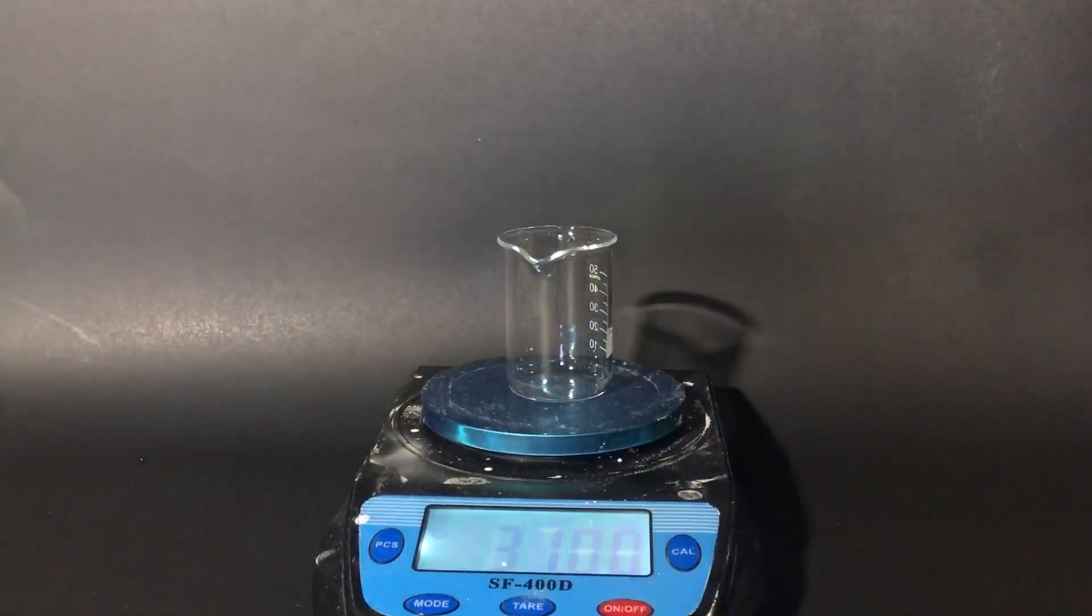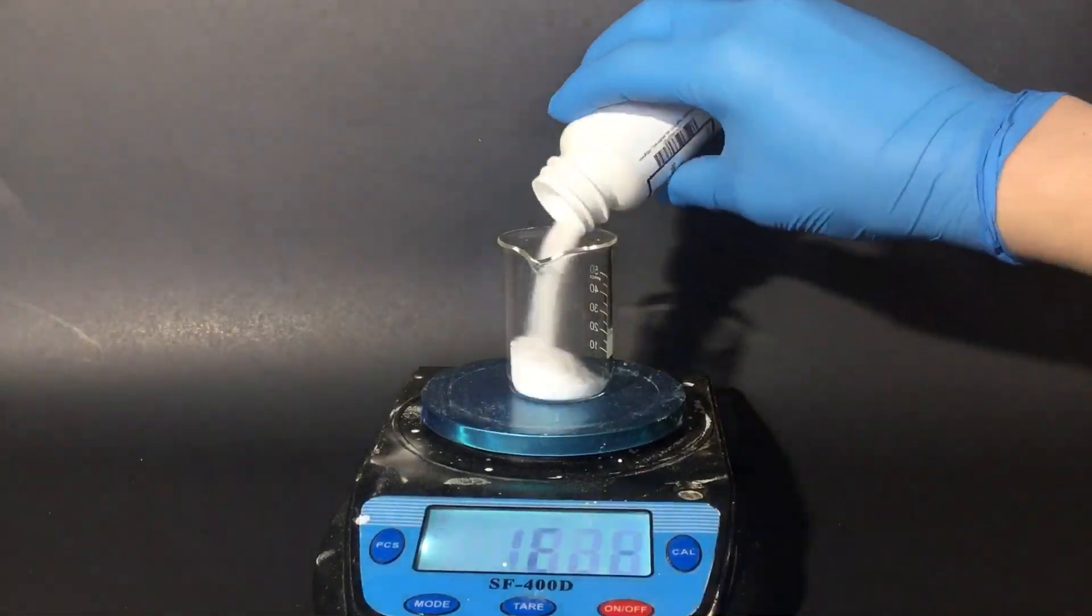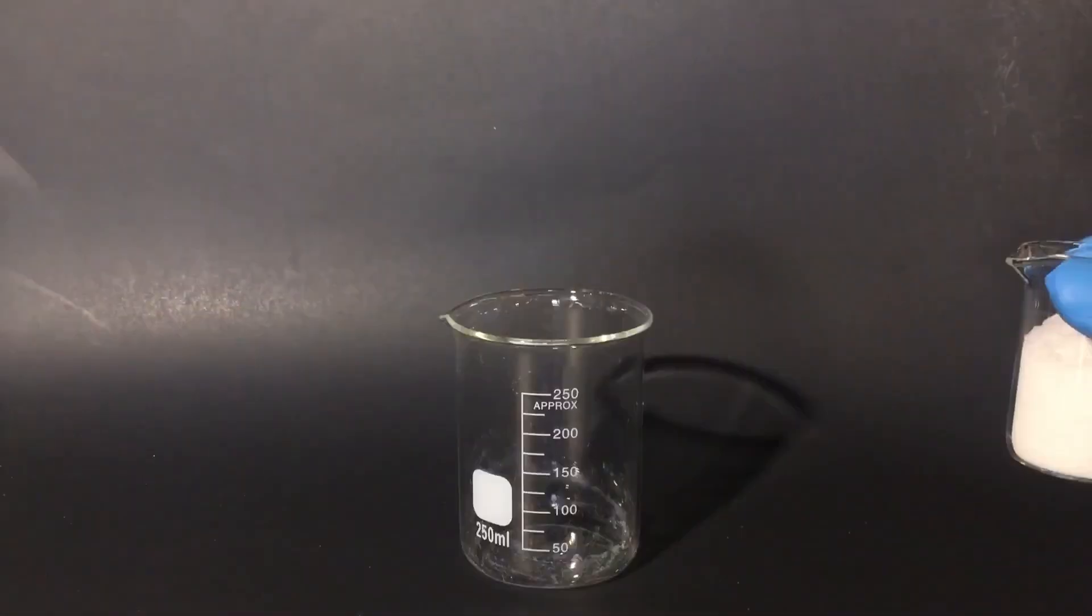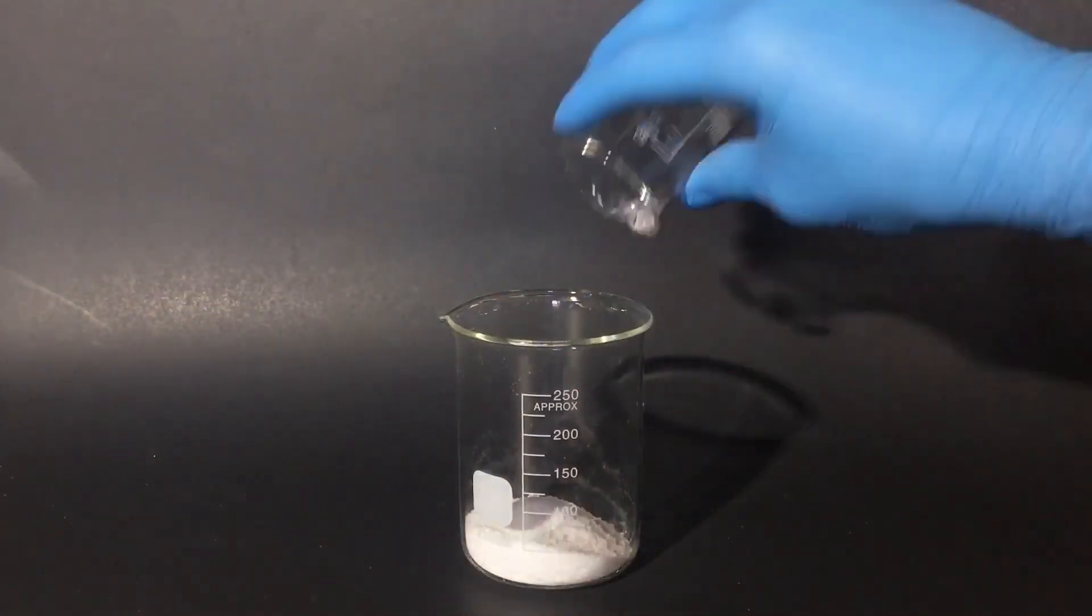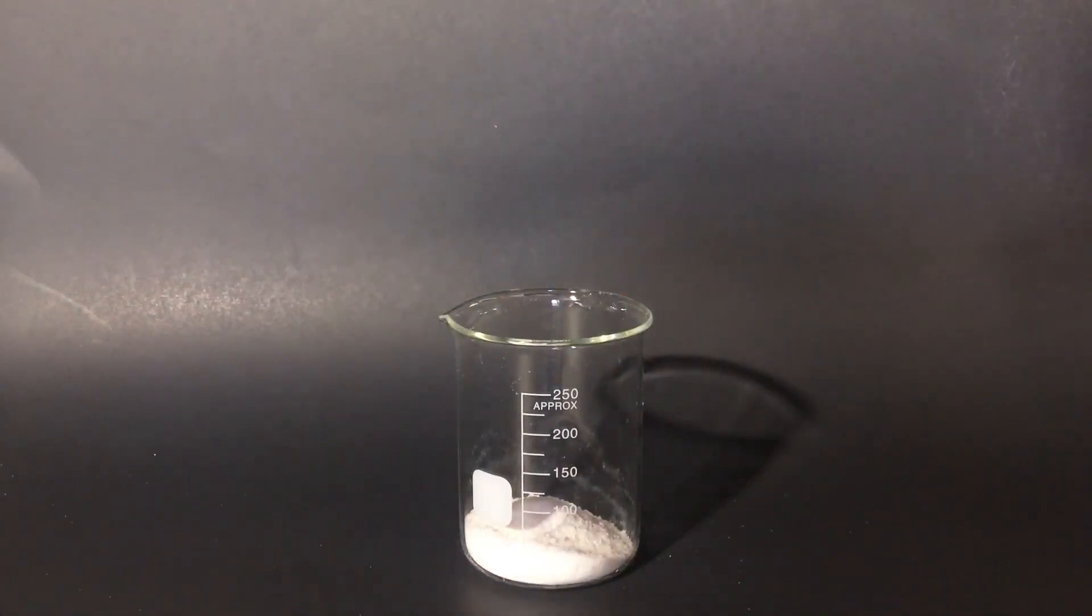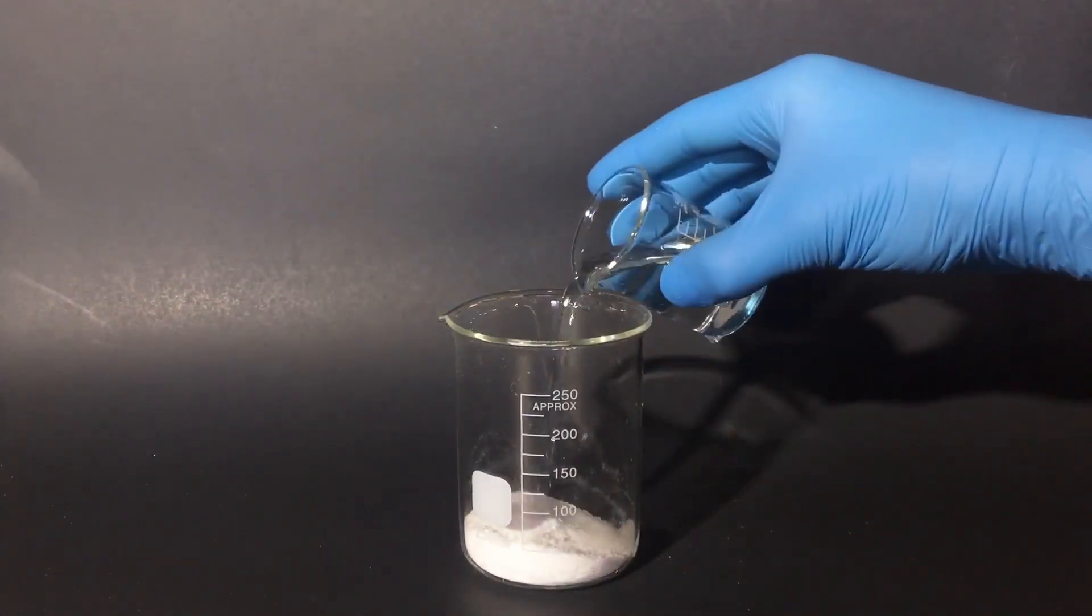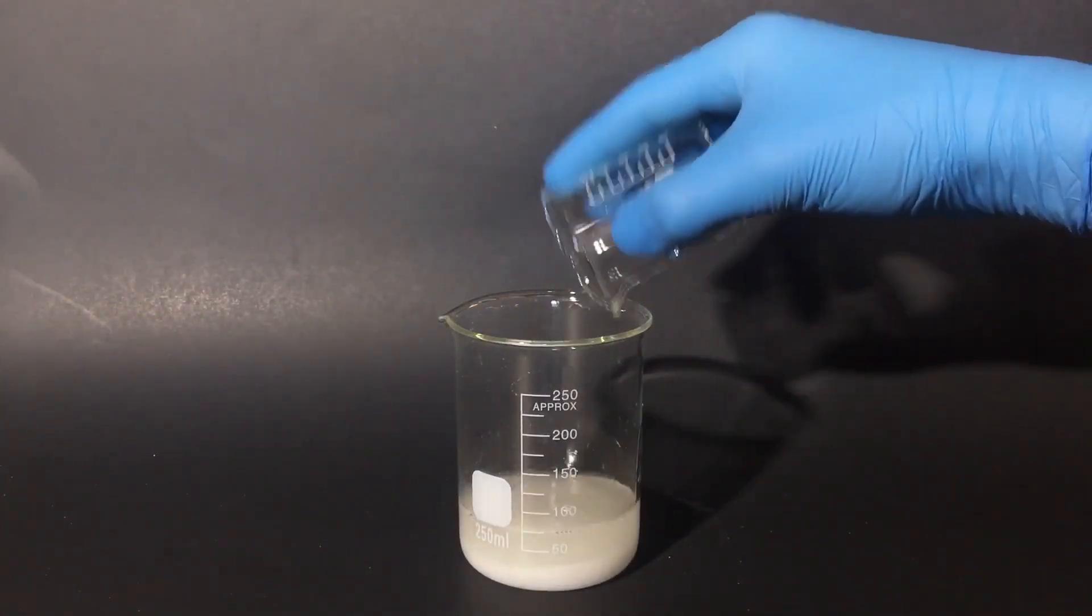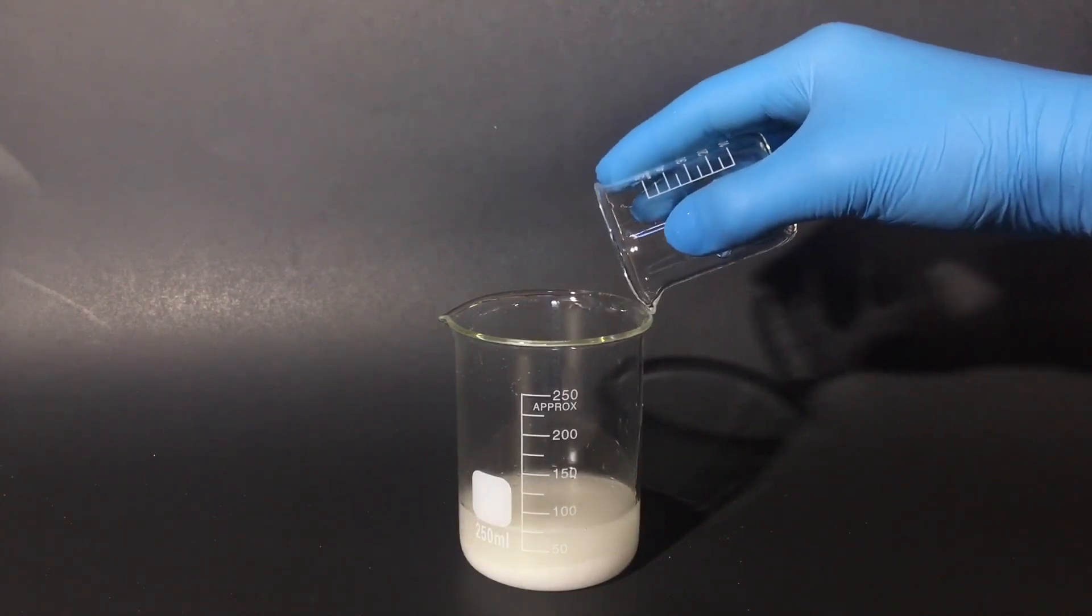First, I set my beaker on a scale and dump in all of my potassium iodide. After measuring it out, I add it all into a separate beaker, and then add an equal amount of water. In my case, I add in 26 milliliters, but you can use any amount, as long as they're equal.